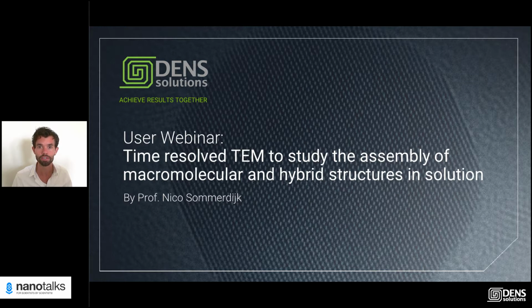This Nanotalk is a recording of another liquid phase electron microscopy user webinar given by Professor Nico Sommerdijk, who did fascinating research using our Ocean system. In this webinar, he presents various research examples that illustrate how time-resolved TEM can be used to visualize the evolution of morphology and structure in solution from the sub-nanometer level up.